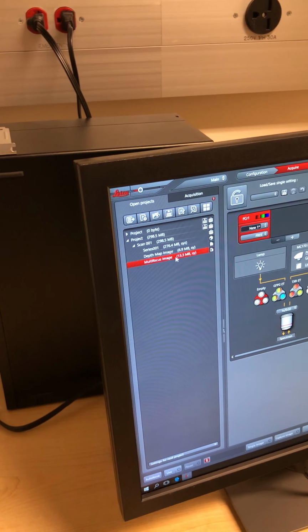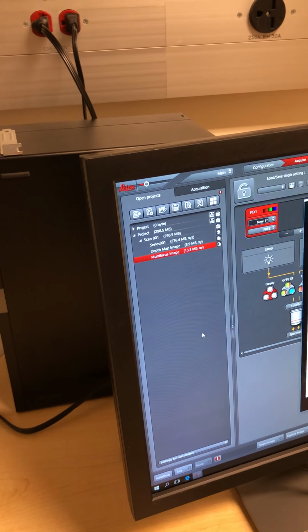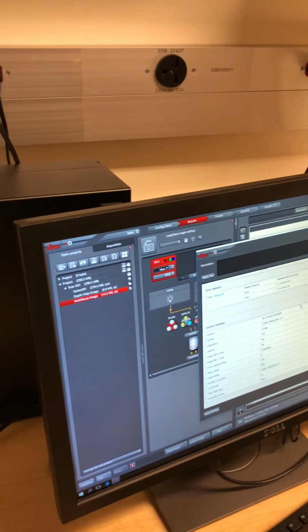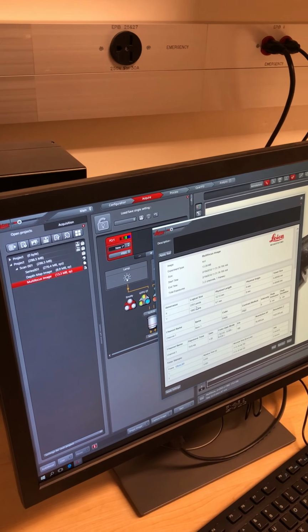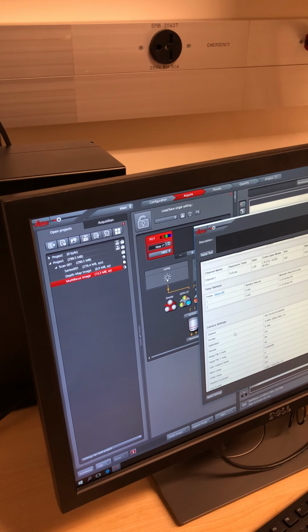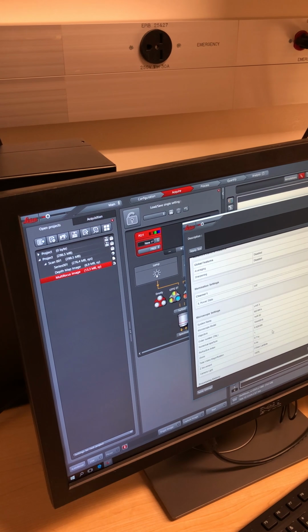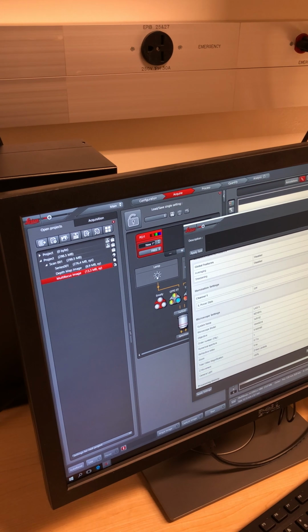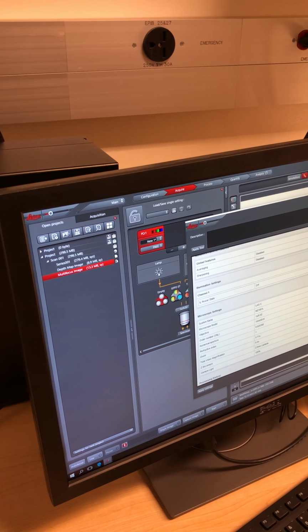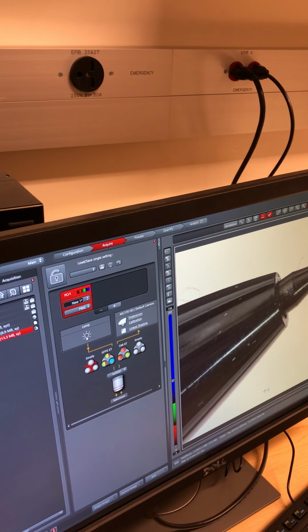So that's where your data is. Okay, now real quick here too, if we right click and go to properties, we can look up all the acquisition settings here. It's going to give you the physical size, so on and so forth, and then information about the camera settings. So just so you know, that's all there, including the zoom position. And so this scale bar should then be accurate. Yes, this should be accurate.